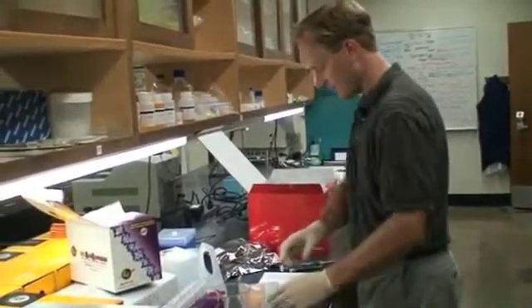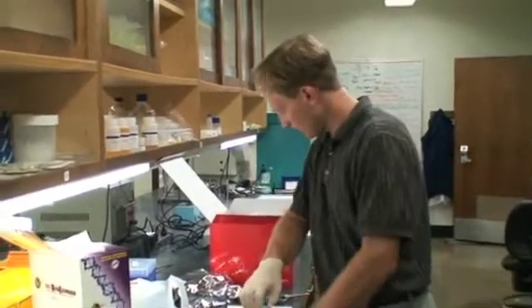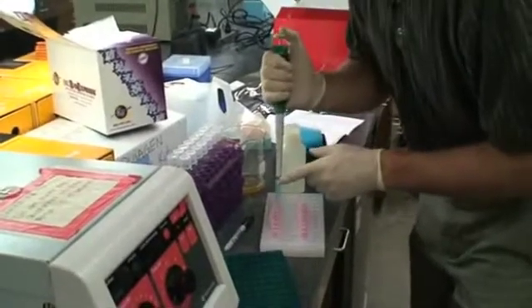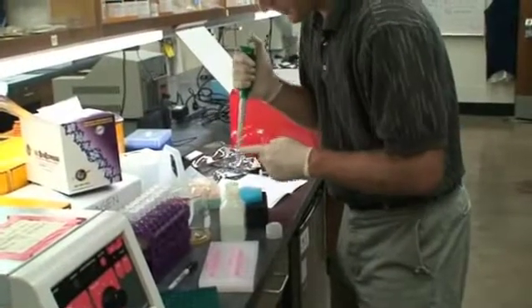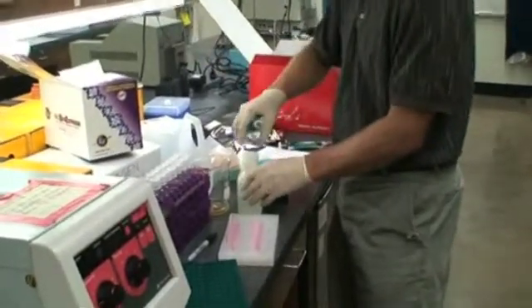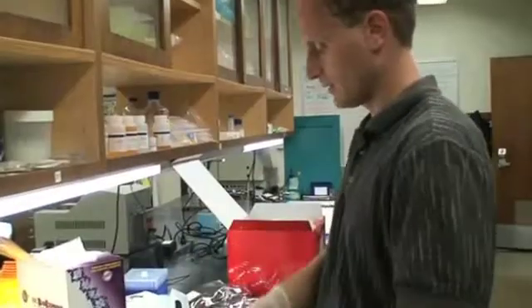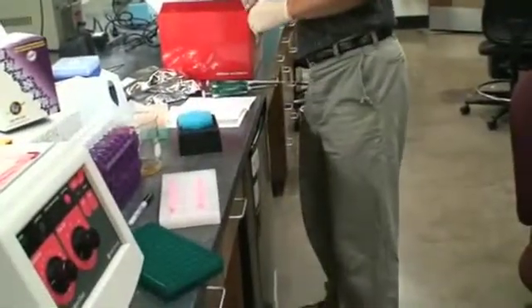Next, we neutralize — we add 350 microliters. I'm only trying to get the blue part of the tip into the solution here. You'll notice there's a little drip at the end — I'm not too worried about getting that in or out. Gently invert four to six times — one, two, six. Put the neutralization solution back.